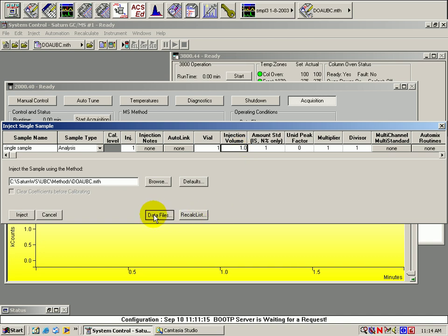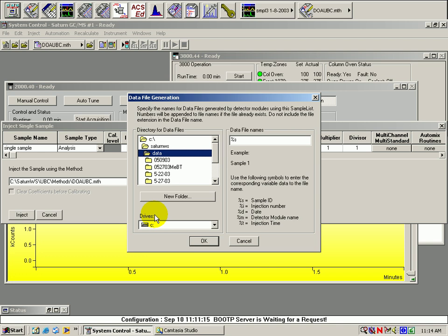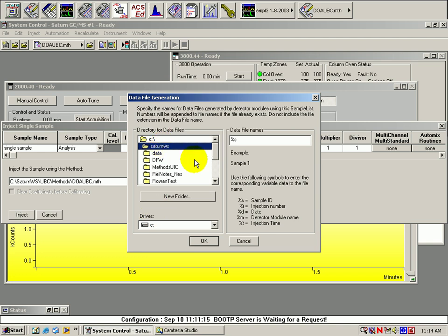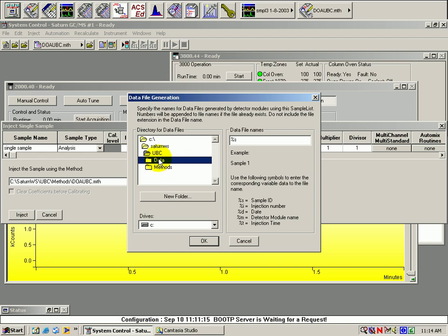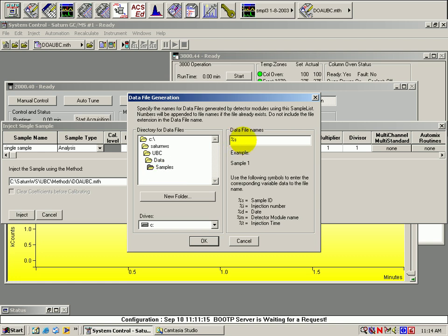Next, locate the folder where you will be storing your data. Once there, fill in the appropriate identifiers in the right half of that panel, and then click OK.